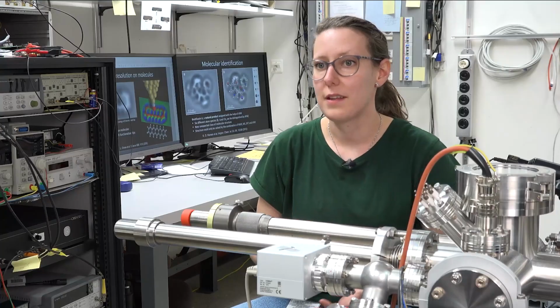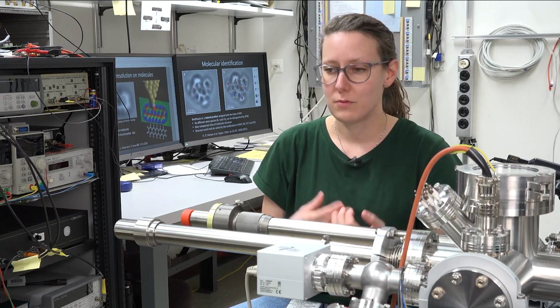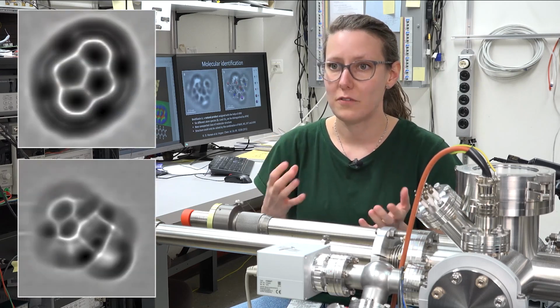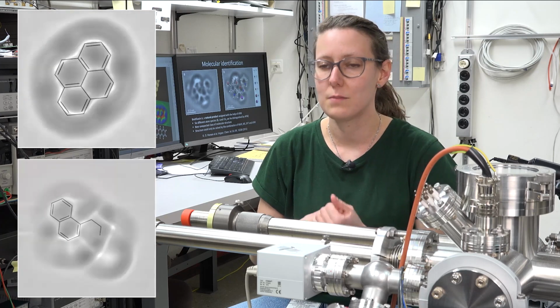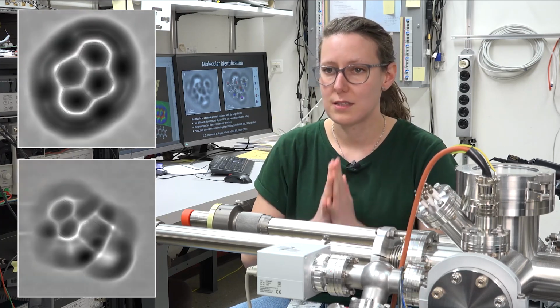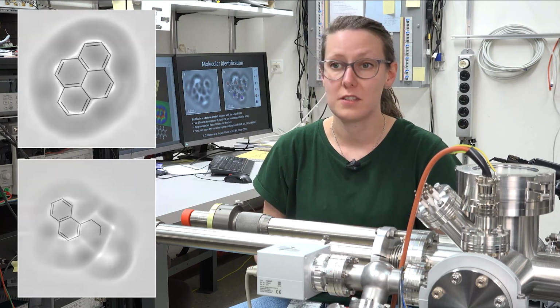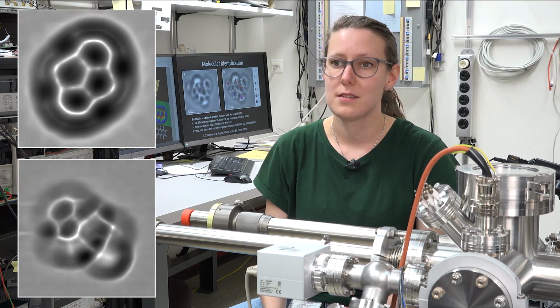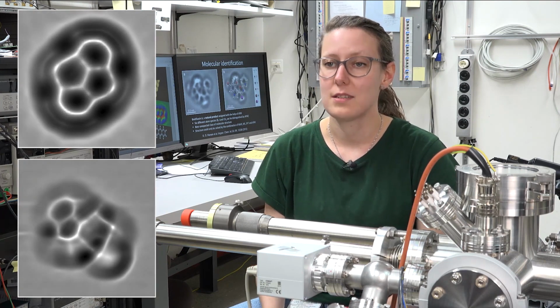One of the core strengths of atomic force microscopy is, first of all, its single molecule sensitivity. So we can really have a look at single molecules from specific samples. And also with AFM, we can really atomically resolve the spatial structure of single molecules. So that is really one means to get real space images with submolecular resolution of single molecules. And that's how we then, in the end, really could have a look at single molecules from a meteoritic source.